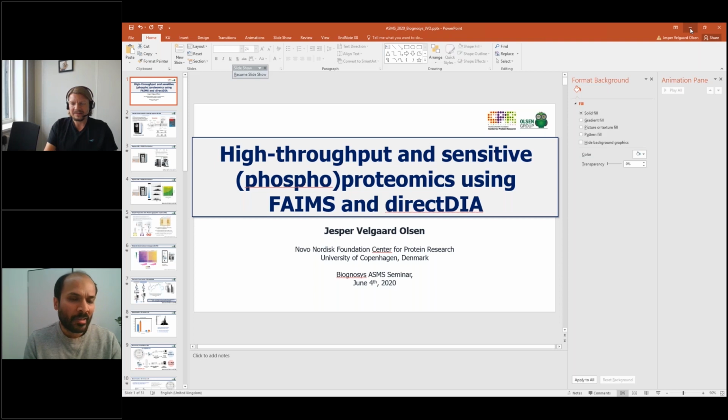Also, what is the cleaning cycle for FAIMS in your experience? Yeah, so if we run 24/7, we typically clean it once a week, and it's a very fast procedure. It doesn't require more than half an hour from when you take it off, clean it, and put it back on again.